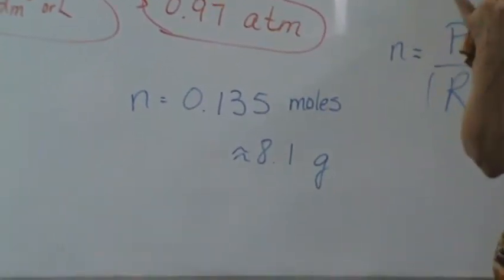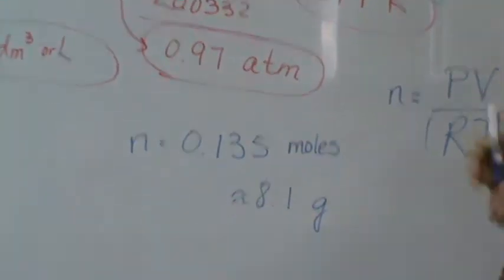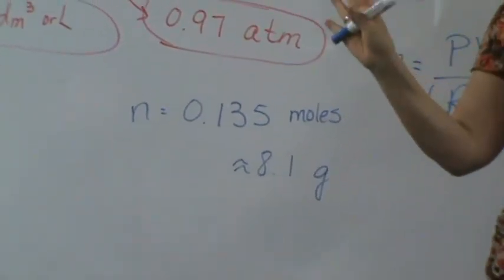On to the next one. In other words, we're expecting between 4 and 5%. That's what we got. We don't really have a percentage error to worry about. Okay, do your best to clear this all out because we're down to 45 minutes to do the other.